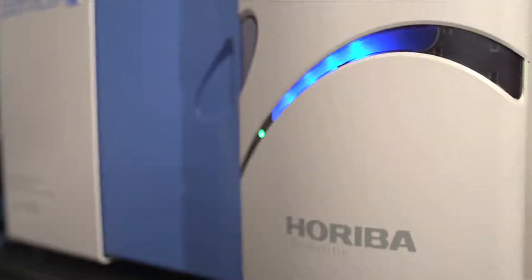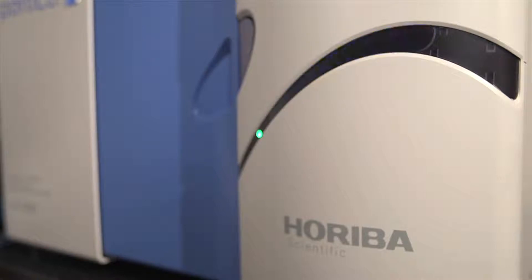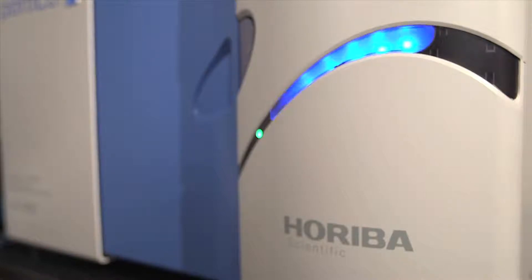We can't wait to do a head-to-head comparison. The LA960 uses Horiba's patented optical design to measure across a broad size range from 10 nanometers to 5,000 microns.